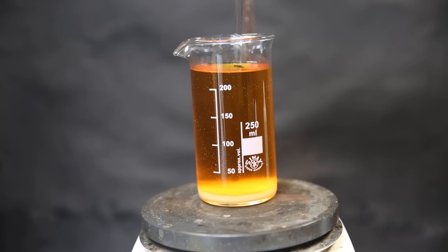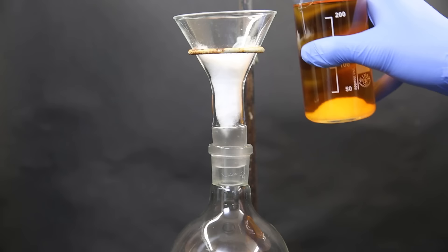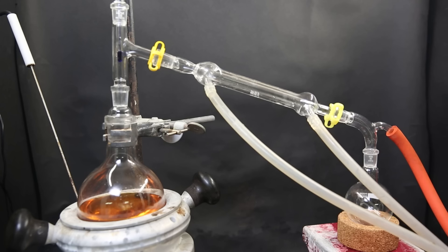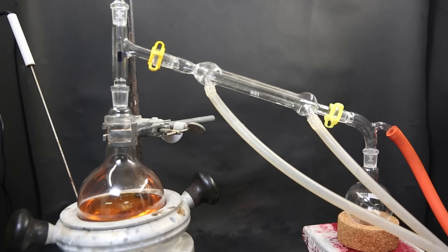Now to remove any remaining water, I dry the mixture with anhydrous sodium sulfate. I then filter the mixture through some cotton to remove the solids. When that is done, I take the filtered mixture and set it up for a vacuum distillation to boil off all of the ethyl acetate.